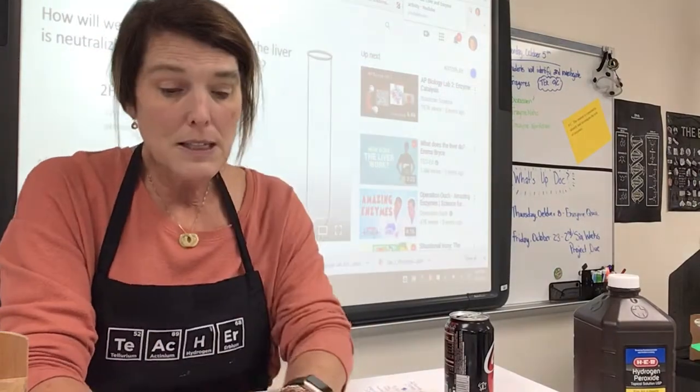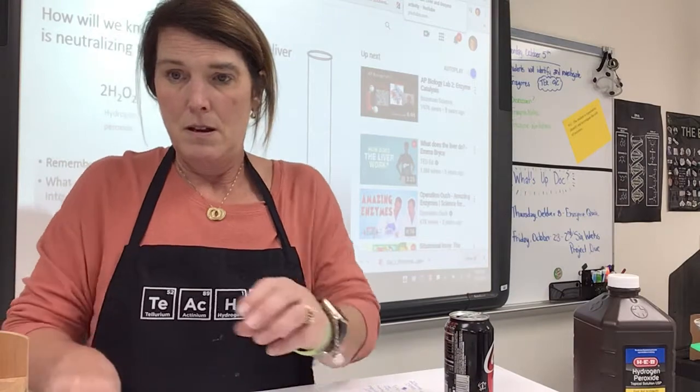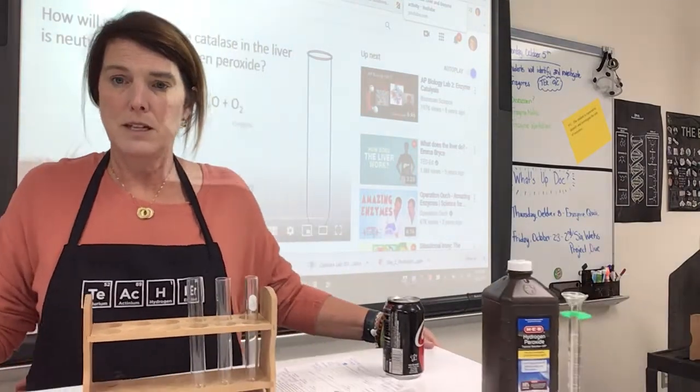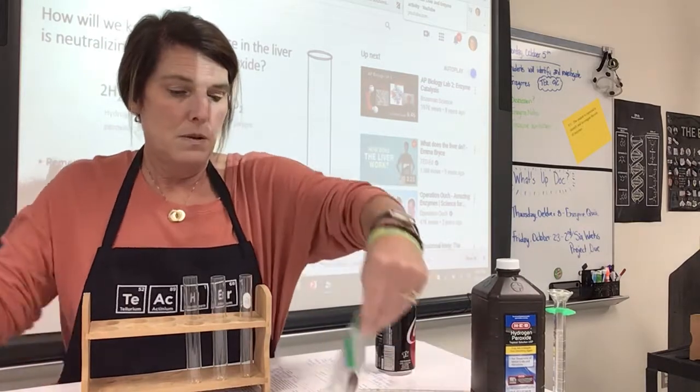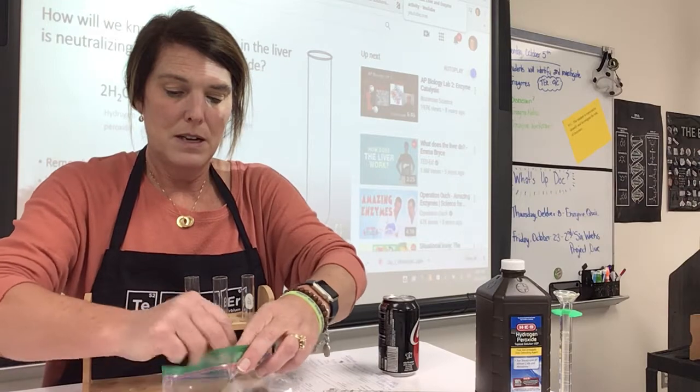Okay, so in this lab, basically we're going to take the liver. I've got my test tubes right here. Let me move back so you can see it better there. So I'm going to put my raw piece of liver in one.